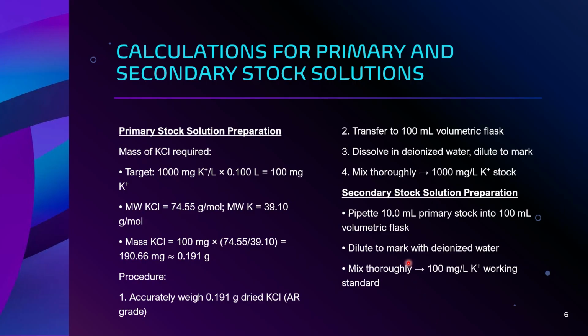Beware that this 10 ml aliquot will be transferred using primary standard glassware, that is pipette or burette. Do not use measuring cylinder to make a secondary stock solution. Stock solutions such as standards or samples are always transferred using primary standard glassware.